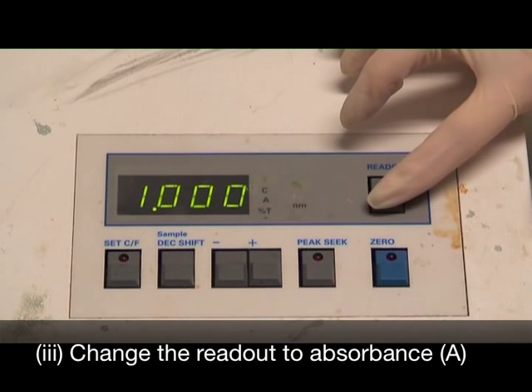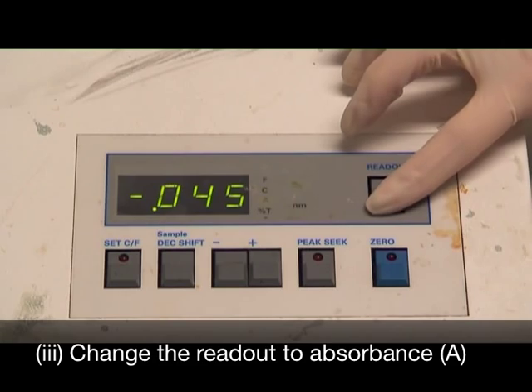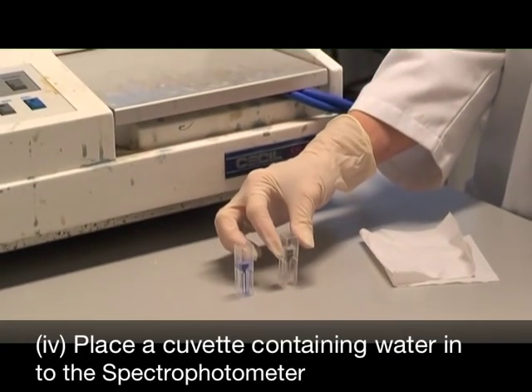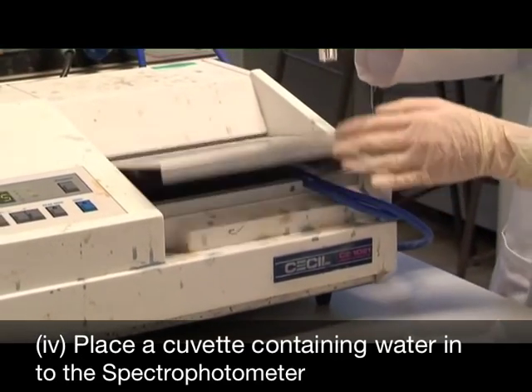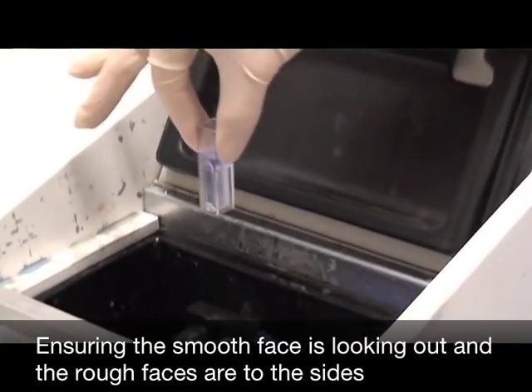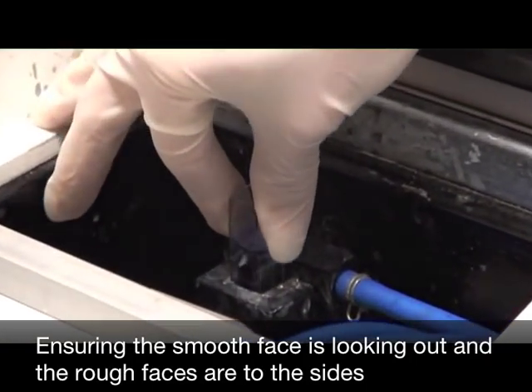Thirdly, change the readout to absorbance. This has been abbreviated to capital A. Now place a cuvette containing water into the spectrophotometer, ensuring that the smooth face is looking out and that the rough faces are to the sides.